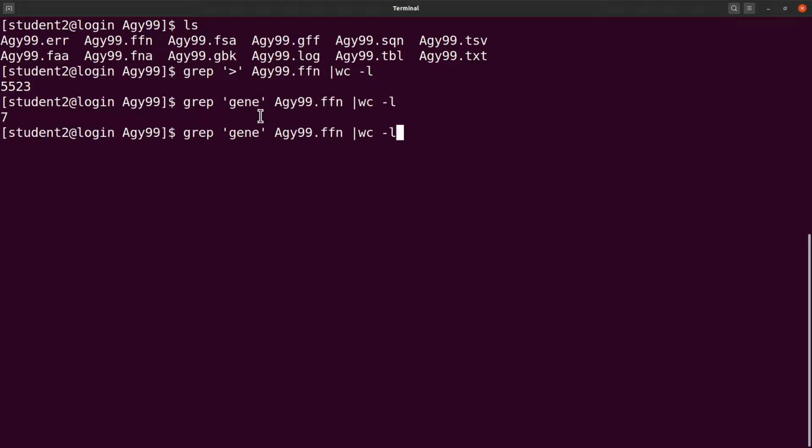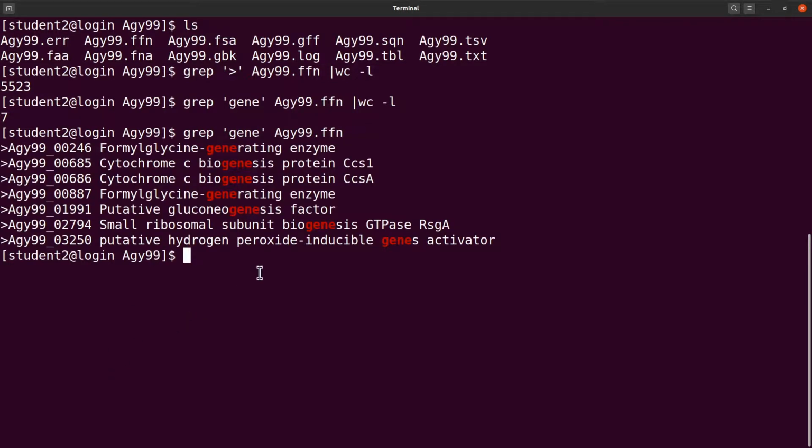We have gen. Let's do some playing here. We have some information here. So at least this one, what is returning is not what we expect it to. Again, I'm only using this to demonstrate why you should be careful when using the grep command. So try and be accurate as much as possible.